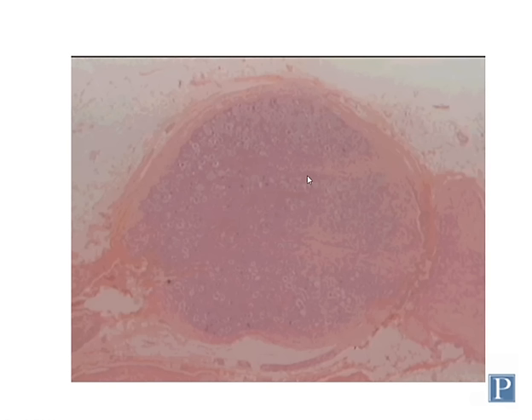Note that nodes of Ranvier can be found in the central nervous system as well as the peripheral nervous system, although these particular axons are teased out of a peripheral nerve. But the clefts of Schmidt-Lanterman are only found in the peripheral nervous system. This is another important peripheral nervous system structure.